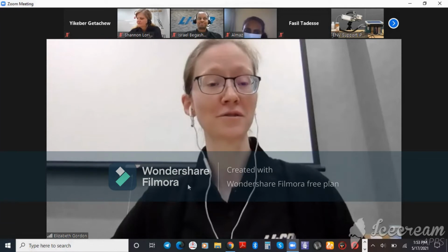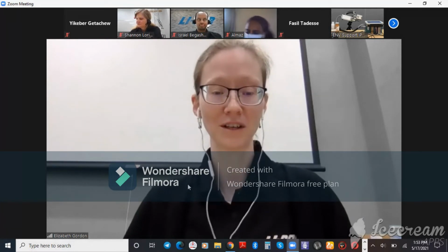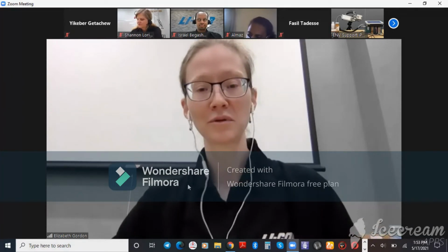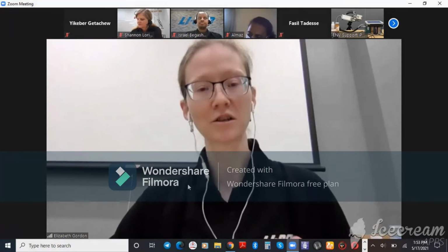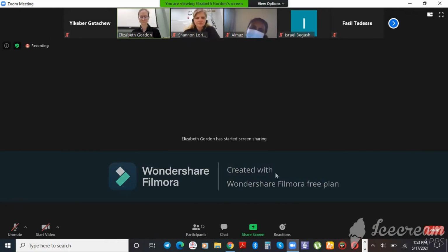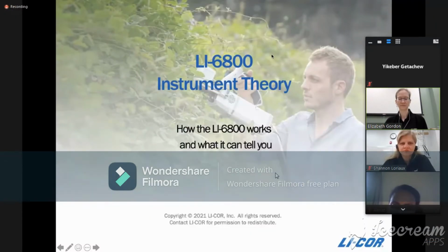What we're going to start with this morning is a discussion of the theory of the LI-6800. We want to talk about how we get the information that we see. Everybody can see my screen? Excellent, thank you.